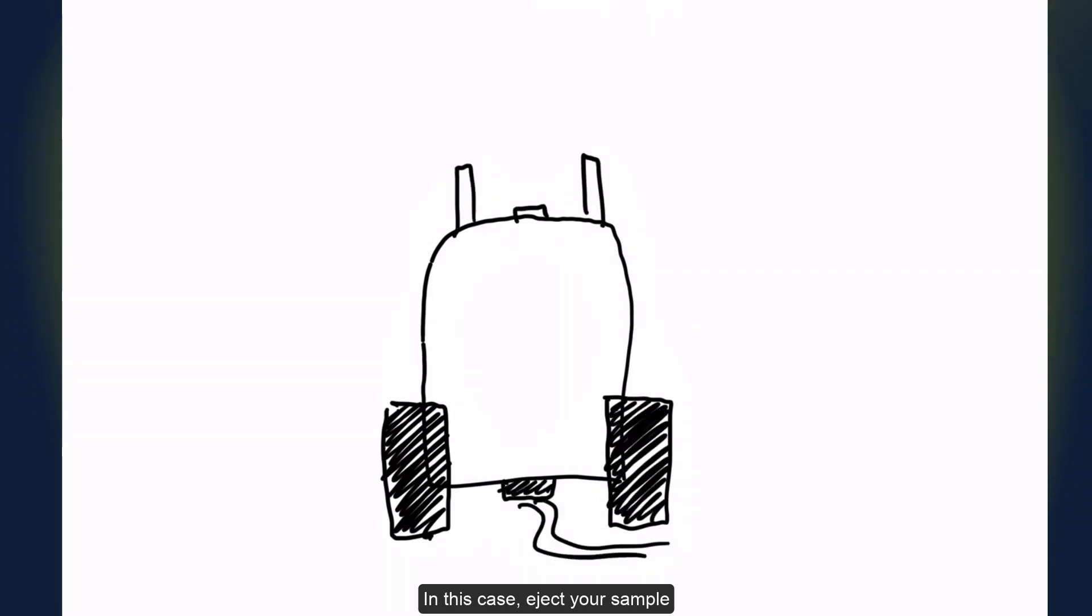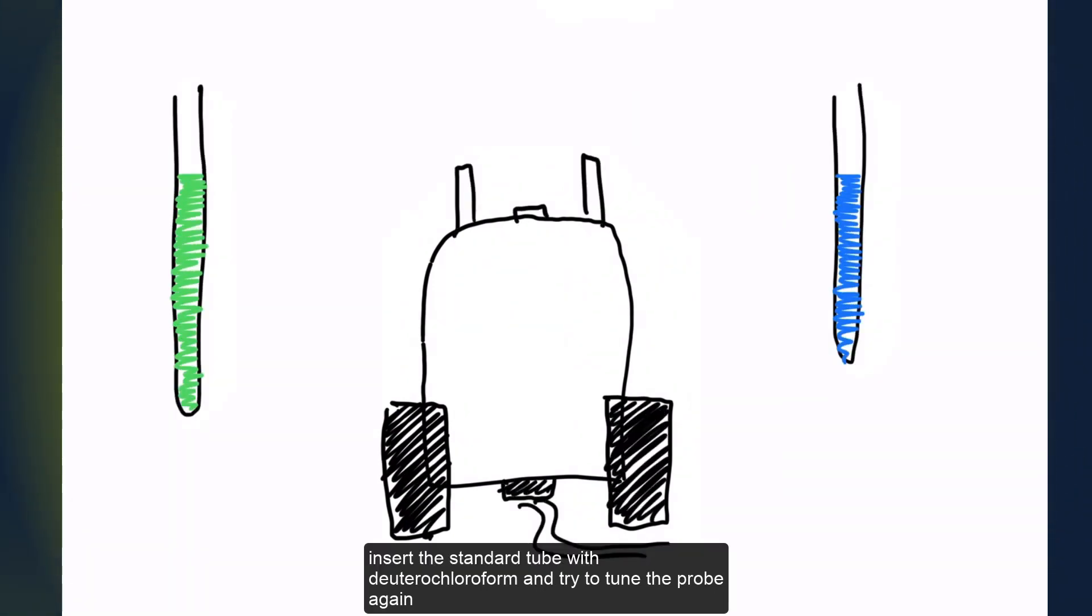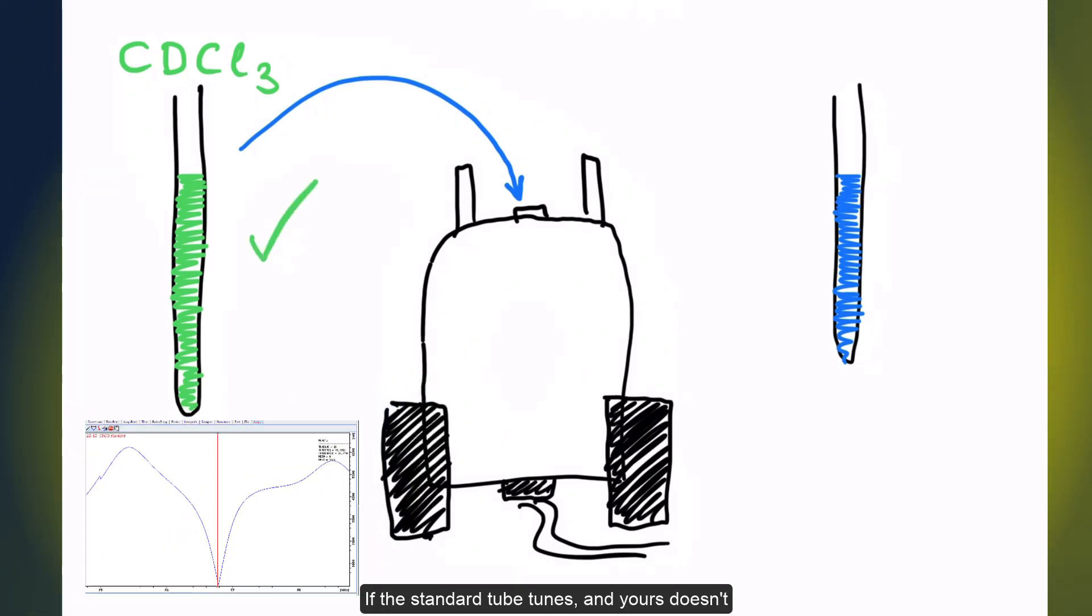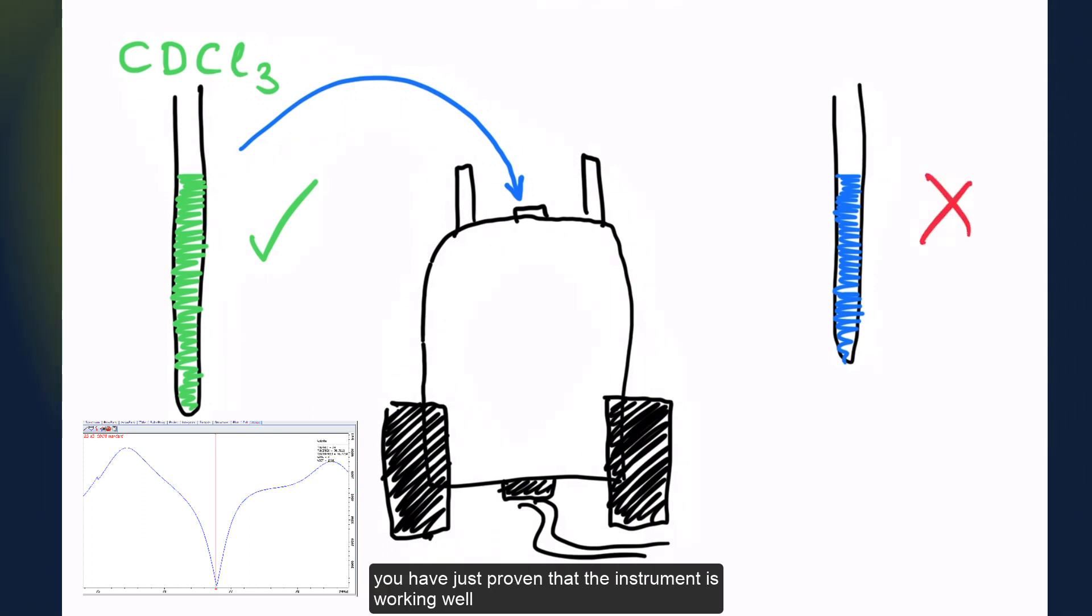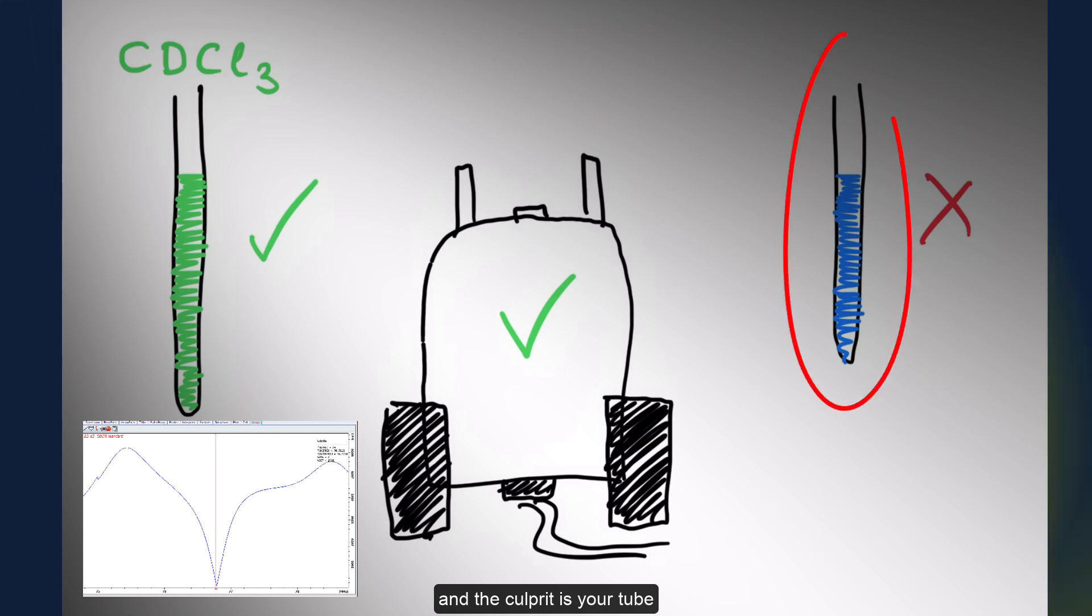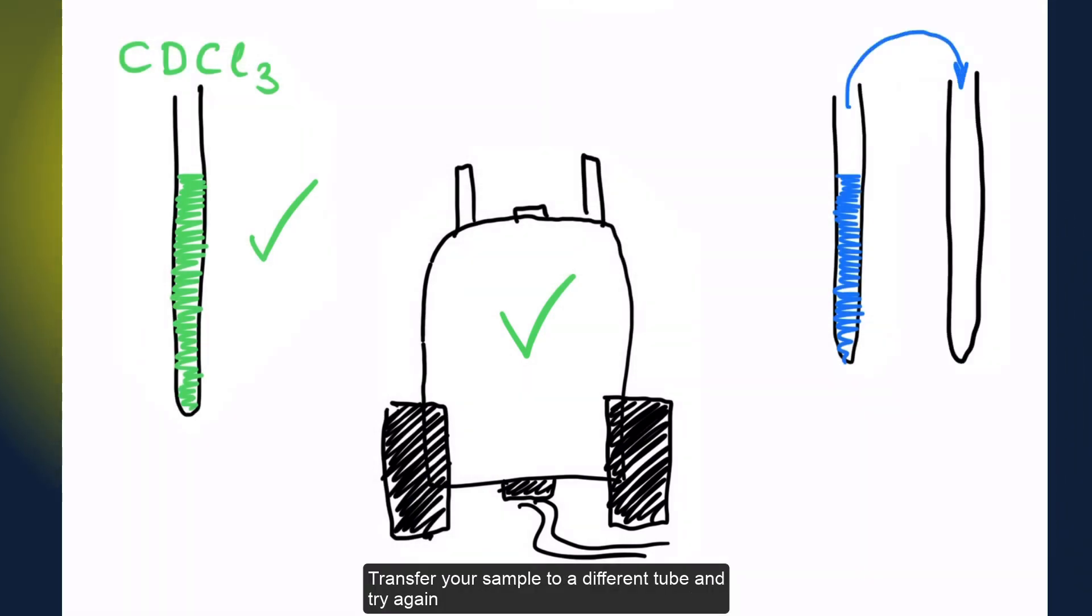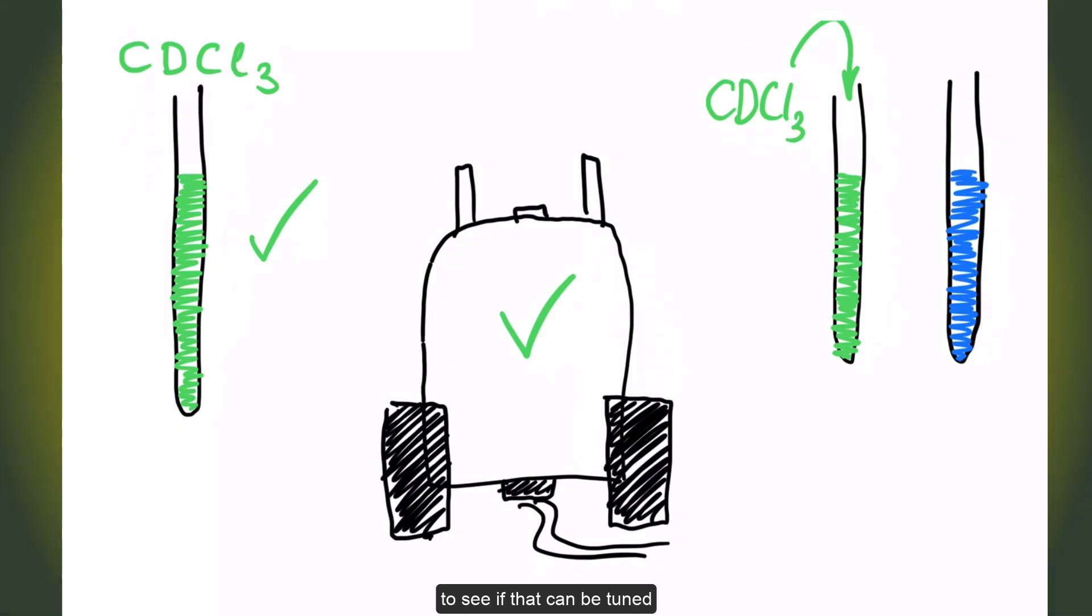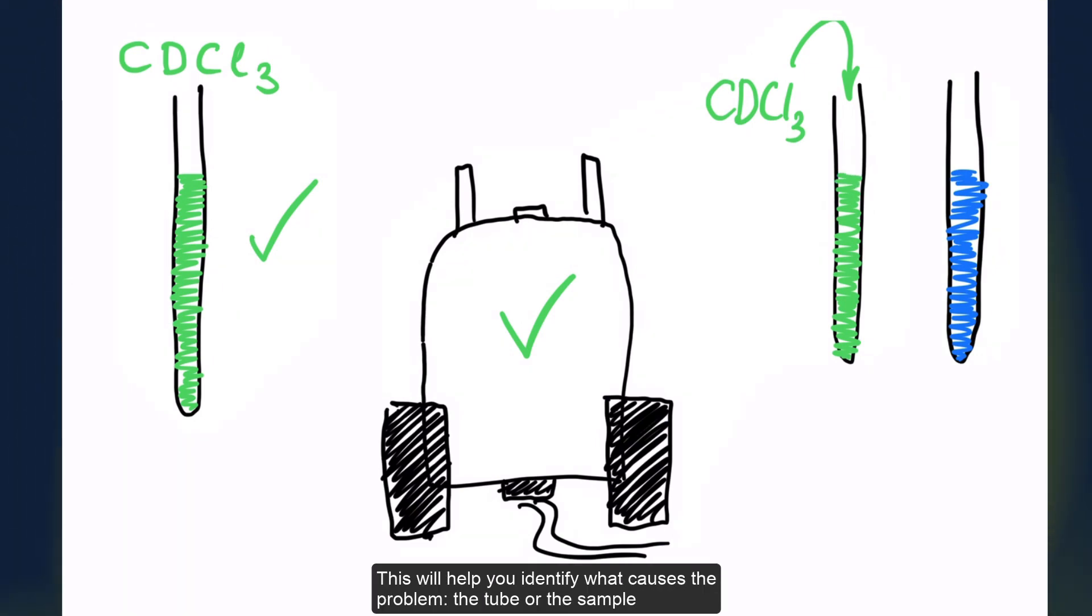In this case, eject your sample, insert the standard tube with deuterachloroform, and try to tune the probe again. Sometimes, defective tubes or precipitating samples prevent tuning. If the standard tube tunes and yours doesn't, you have just proven that the instrument is working well, and the culprit is your tube. Transfer your sample to a different tube and try again. You may also check your tube directly by adding pure solvent to your bad tube to see if that can be tuned. This will help you identify what causes the problem, the tube or the sample.